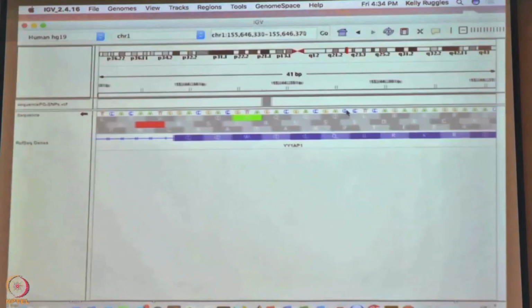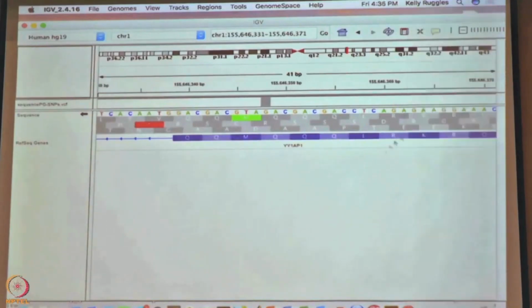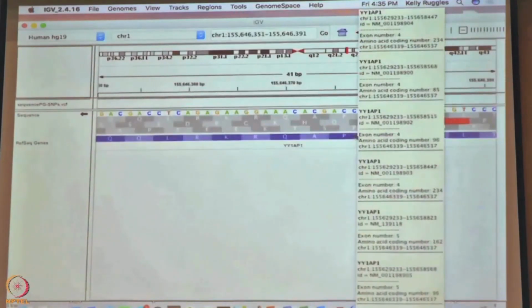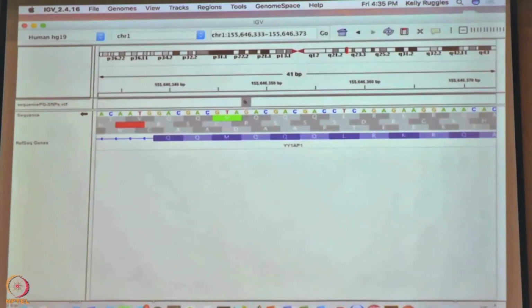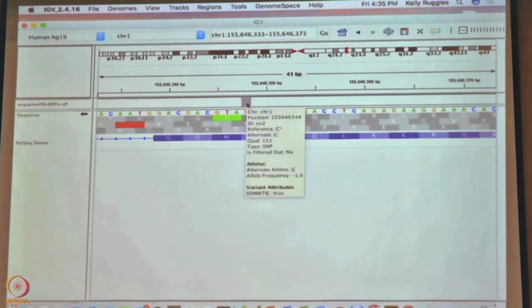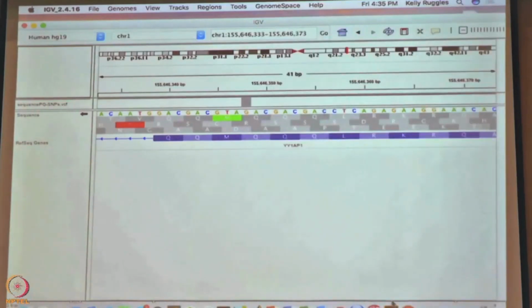The objective here is to go through the sequence, and you can start wherever you want, and just by hand figure out how to create this peptide that has this SNP in it. So just take some time, and what you'll want to do is kind of what I did in the last one, where you go from amino acid to amino acid until you hit the SNP, and then you make sure that you encode it correctly, and then you keep going to get the final tryptic peptide. Does that make sense to everybody?